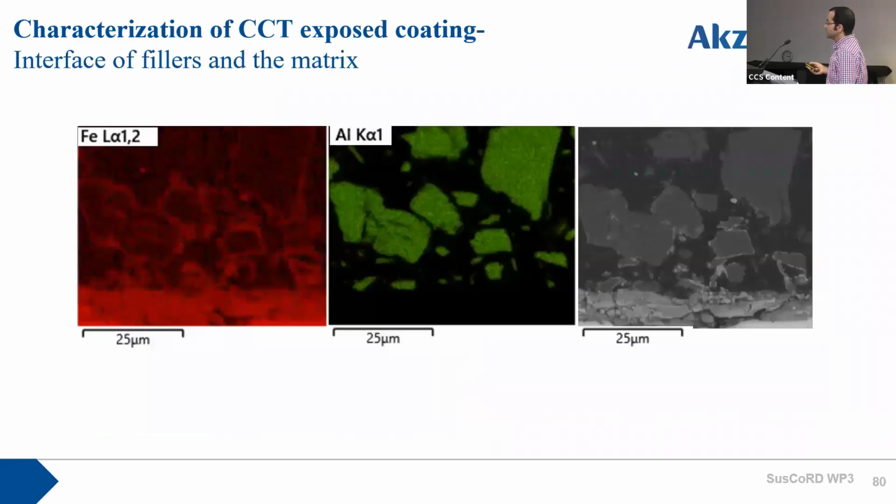The other thing that we observed is that when we have clusters of particles very close to each other, when the corrosion happens, we can see that the interface of these particles gets decorated with corrosion products. So the question is what is happening at that interface? Is there a gap there, or is there a chemical change within that interface that allows more accommodation of the corrosion products?